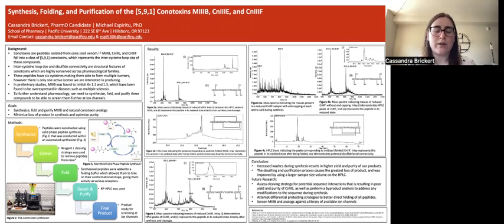If you look to figure 1, you will see a diagram outlining solid phase peptide synthesis. In short, we start with a resin. There are several different kinds of resin, but we used a rink amide and a clear acid resin. In my poster, you will see specifically acid resin synthesis data. The resin is like a bead that has lots of different linker regions on it, where amino acids can be added to form our peptide.